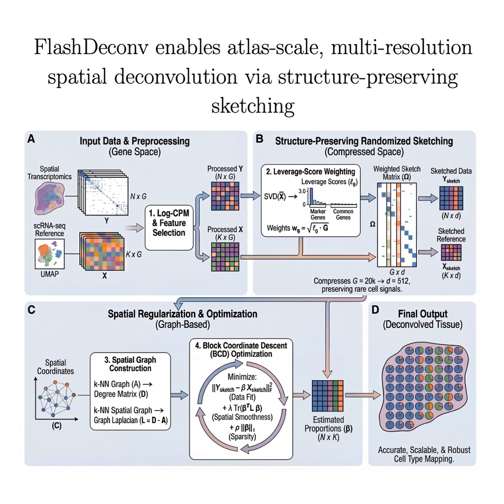They called it the abundance invariance stress test. Oh, that stress test is the mathematical proof of concept. It's beautiful. The researchers took mouse brain single-cell data and artificially destroyed the abundance signal. They took the dominant cell type, oligodendrocytes, about 27% of the total, and systematically downsampled it. Wow. They reduced its frequency by over 60-fold, all the way down to just 0.4%.